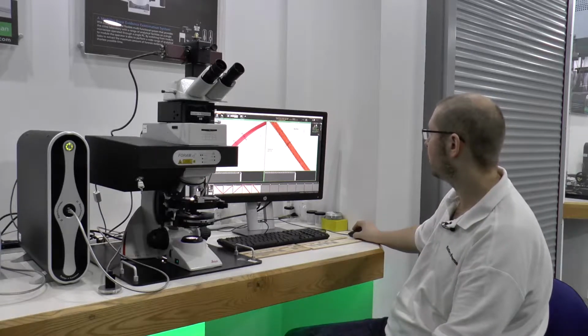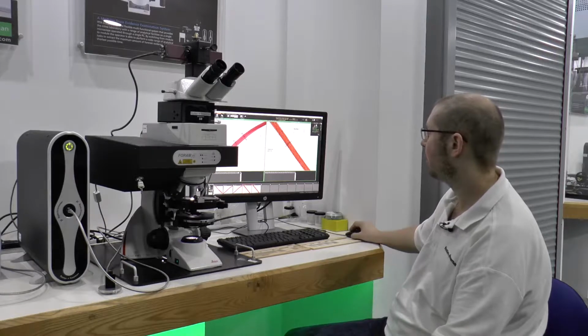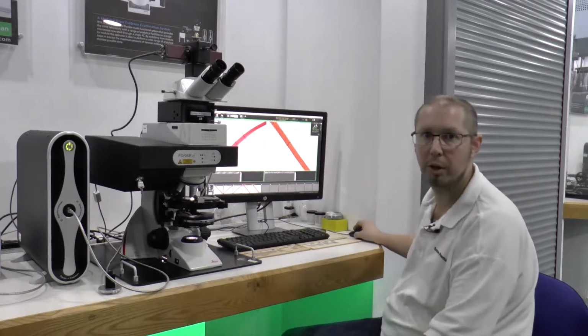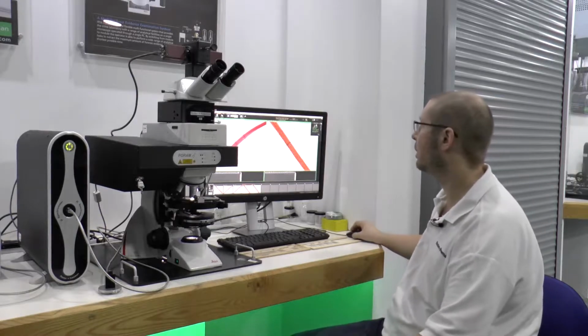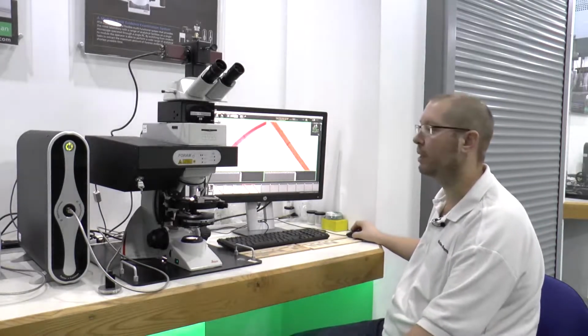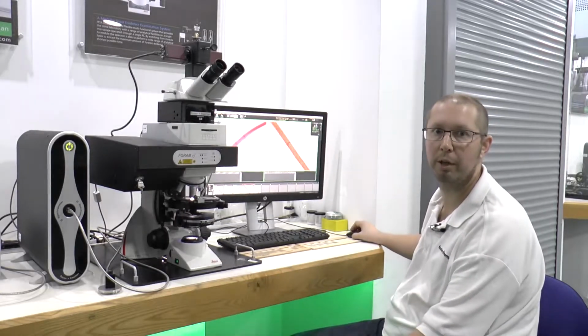And here we can also see that the size of the fibres are quite different. The fibre here on the left hand side is about 15 microns, and then the other fibre over here we're comparing it to is about 20 microns. So quite easily we can generate high quality, high resolution images and use the calibrated measurements function to take accurate measurements of our samples.